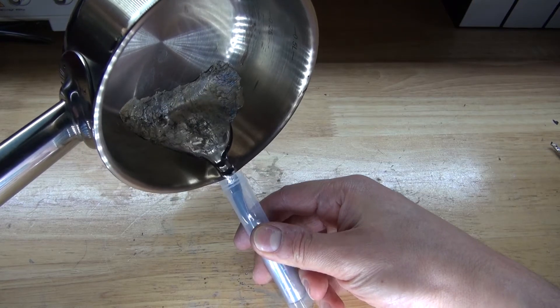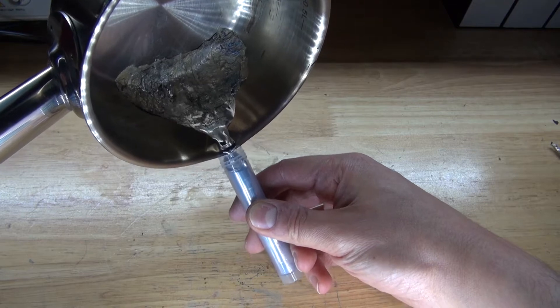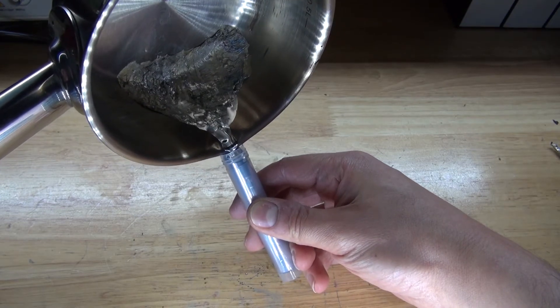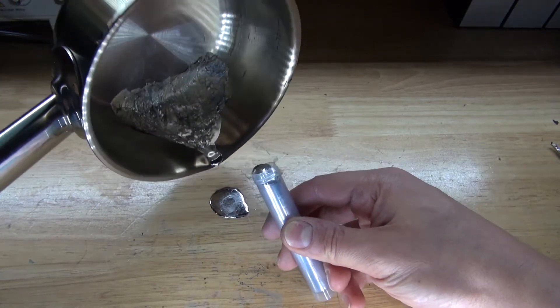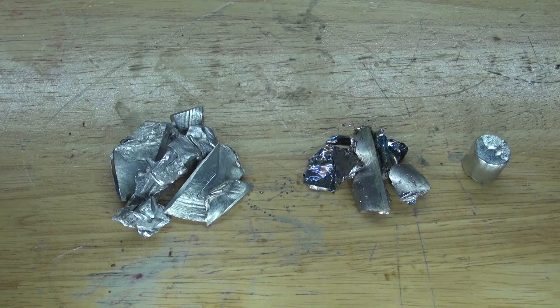Hello and welcome back to SciTiTech. In this video I'm going to show you how to make a eutectic alloy called Fields Metal, which has a melting point of 62 degrees Celsius or 144 Fahrenheit. This metal has very interesting properties and is an excellent metal to use for casting. It uses three elements: indium, bismuth, and tin.